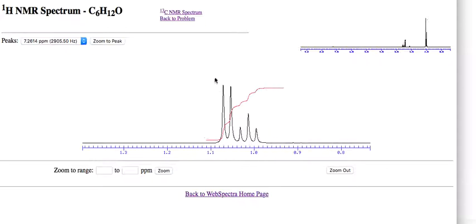So I'm going to assign that this is, if we had 9 hydrogens left to play with, we had the 1 to 2, and that would make this 9. I'm going to go with 6 and with 3. Now I'm not doing that with a ruler right now, but it could be done to get it roughly consistent with that. So the first one is we've got a doublet here.